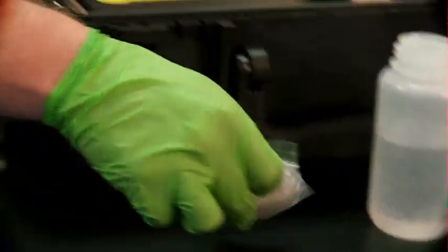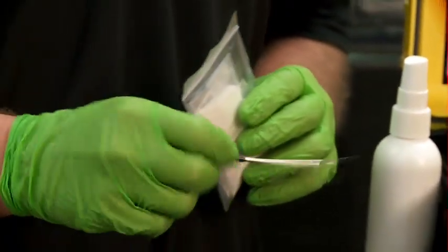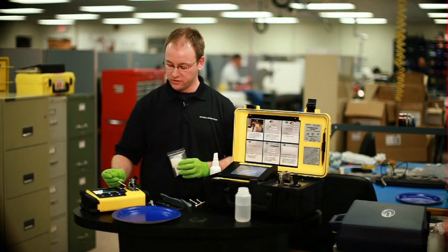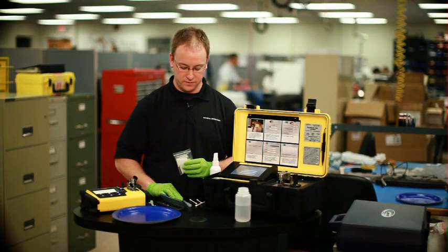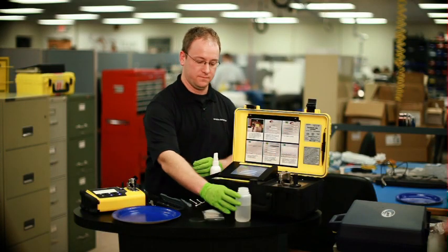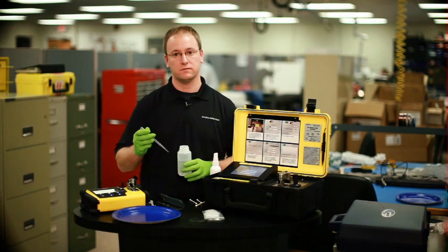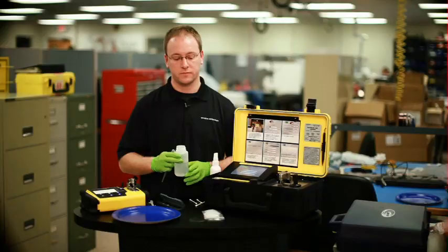If you're presented with a white powder sample in a plastic bag, you simply take a spatula, scoop out a small amount of that material, and place it on the diamond sensor of the device for analysis. Similarly, if you have a liquid in a container, you take a pipette, draw out a couple drops, and place it on the same sensor.